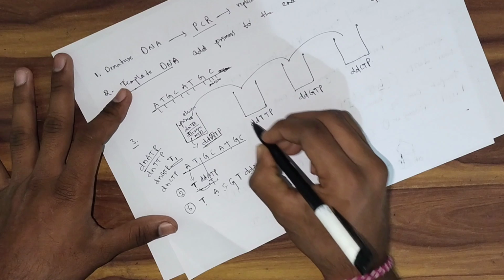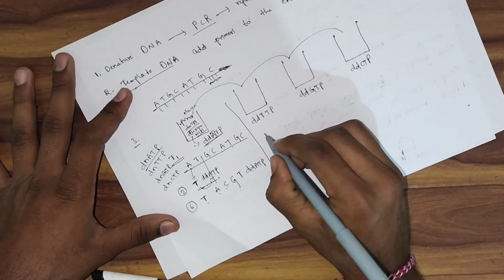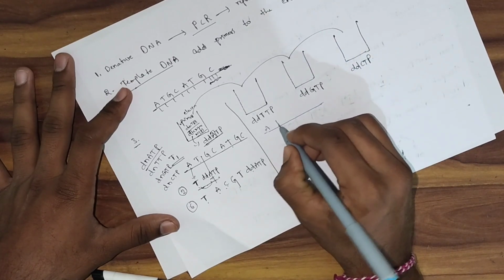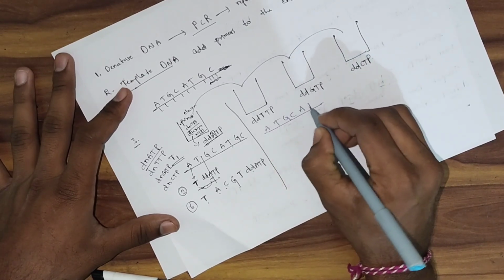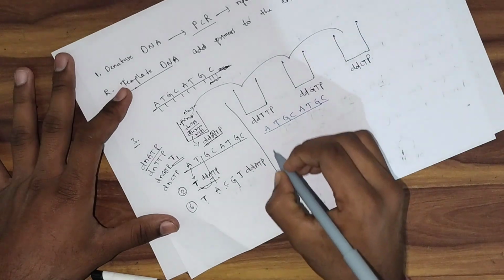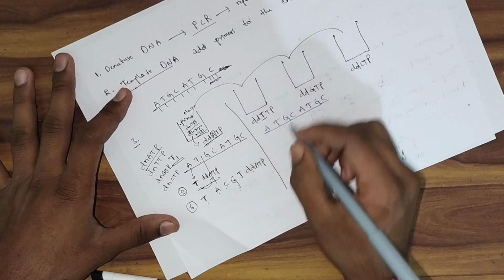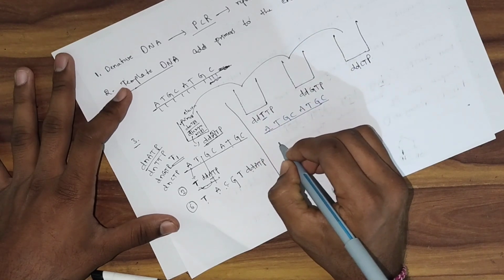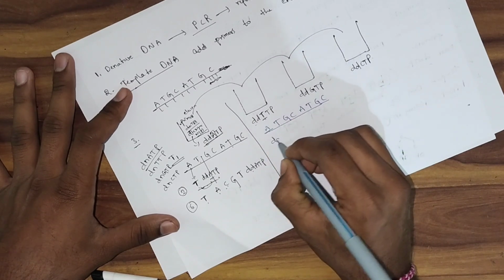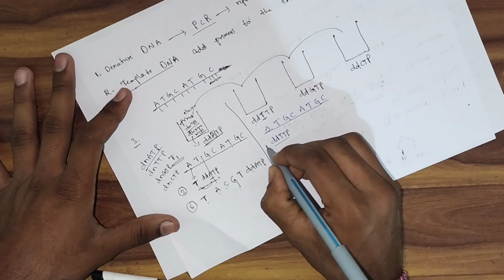So if we take the second tube, then take one strand. What is the complement? AT GC AT GC. Then what is the complementary strand to it? Here is dideoxythymine. What is the adenine complementary? Dideoxythymine, so dideoxythymine triphosphate. There is only one.